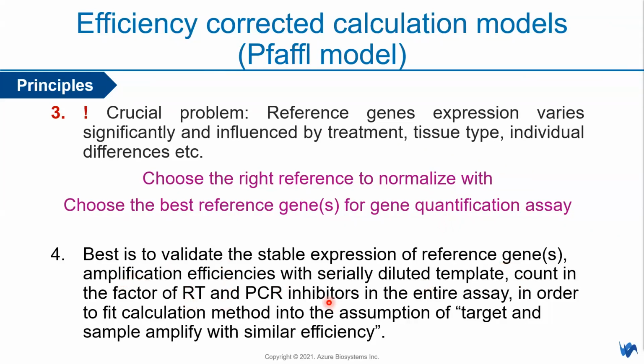Because qPCR itself is not only about primers, we're talking about templates and everything. The qPCR is also important. If you have a more complex, let's say one-step qPCR assay, it is much more complex. So you also need to take these into account as well.